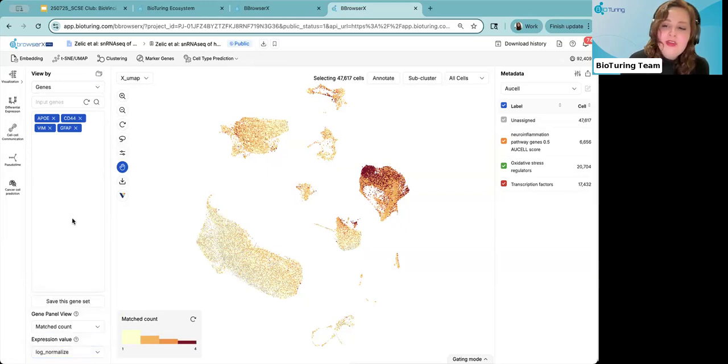So when you're running AUCell enrichment, what it tries to do is look at how there are specific cells within your study that are active or have a specific enrichment score across the entire gene set. So it's not counting the specific log normalized score for that individual gene, but it's showing you an enrichment score of the entire gene set. So it's sort of a normalized enrichment score, and that's in order to identify whether there's an enrichment of a particular pathway.